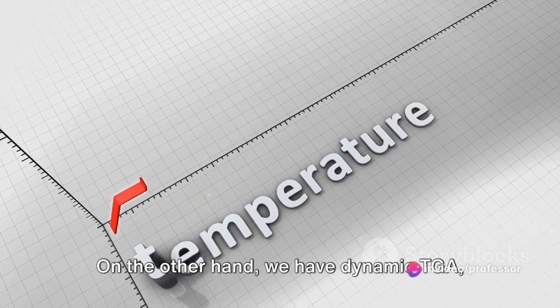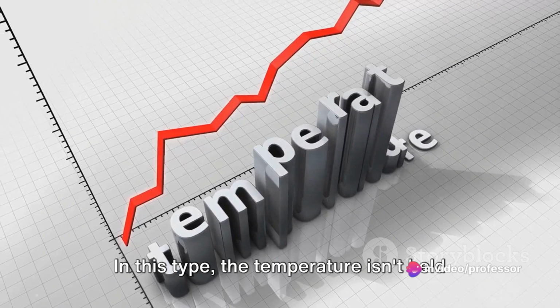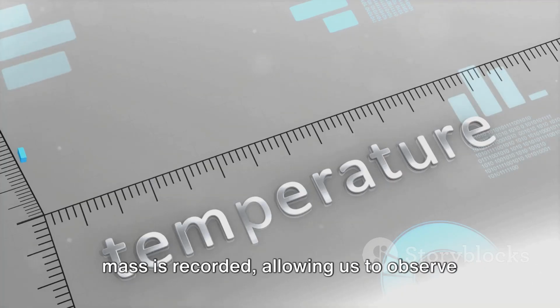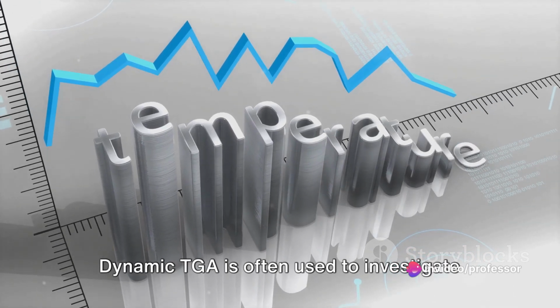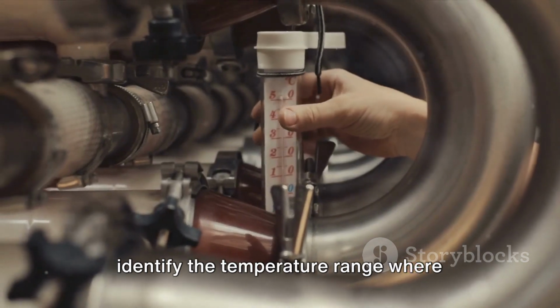On the other hand, we have dynamic TGA, which is a bit more, dynamic. In this type, the temperature isn't held constant but is steadily increased at a fixed rate. As the temperature rises, the sample's mass is recorded, allowing us to observe how it reacts to the changing heat conditions. Dynamic TGA is often used to investigate the thermal stability of materials or to identify the temperature range where significant mass changes occur.